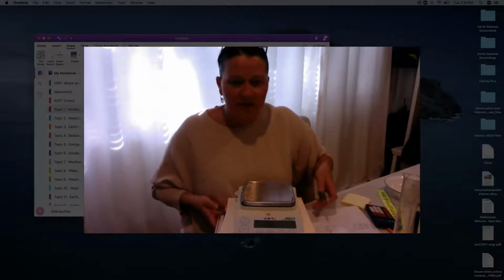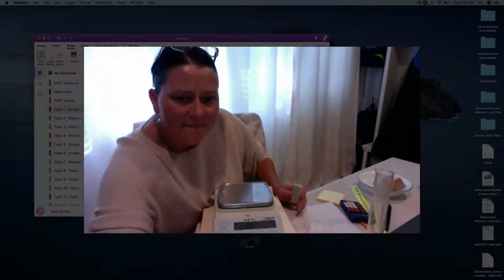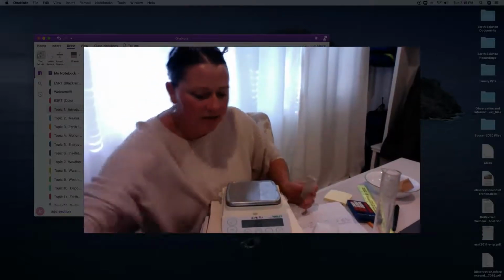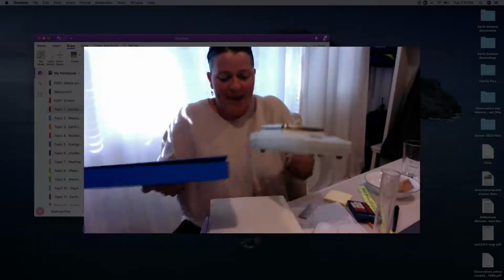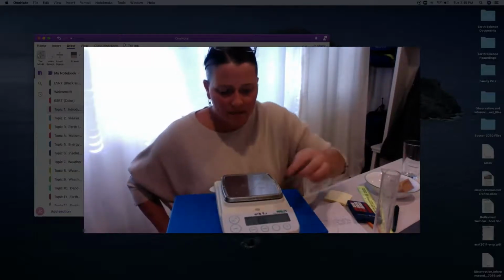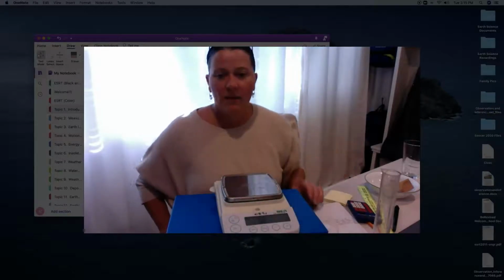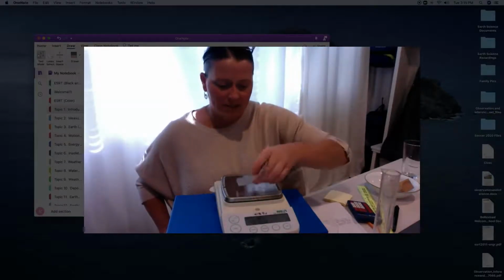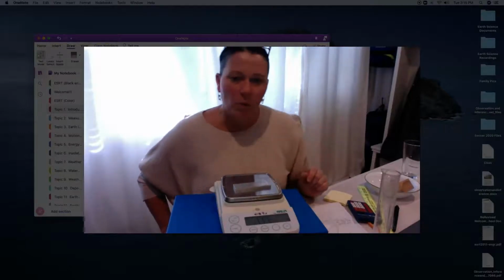I got to get it on a flatter surface here for you guys. Let's see if I could tilt my screen down just a bit. Make sure that I'm recording this on my screen. Just let this up a bit so you can see. There we go, that's a bit better. Okay, I'm going to get my mass 0.0, re-tare this to 0, and I'm going to get the mass of my aluminum bar by just simply placing it on the scale. Now I know this is backwards in your screen, but it does read 37.7.